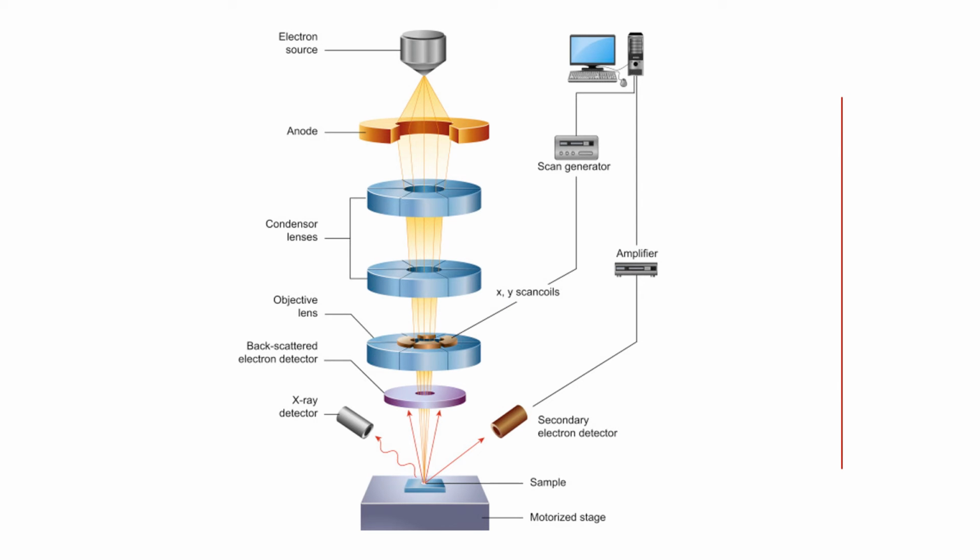Now, finally, we have this slide which helps us visualize those parts in working. We have the electron source, which consists of cathode and anode. Then we have the blunt beam of electrons, which is of high velocity, passing through condensers. Now see here, we have two sets of electromagnets to produce a highly pointed beam.